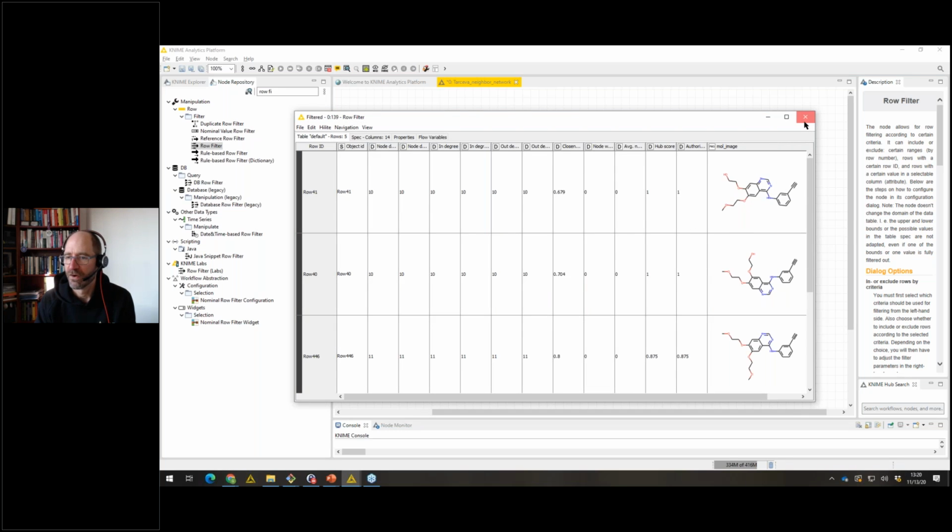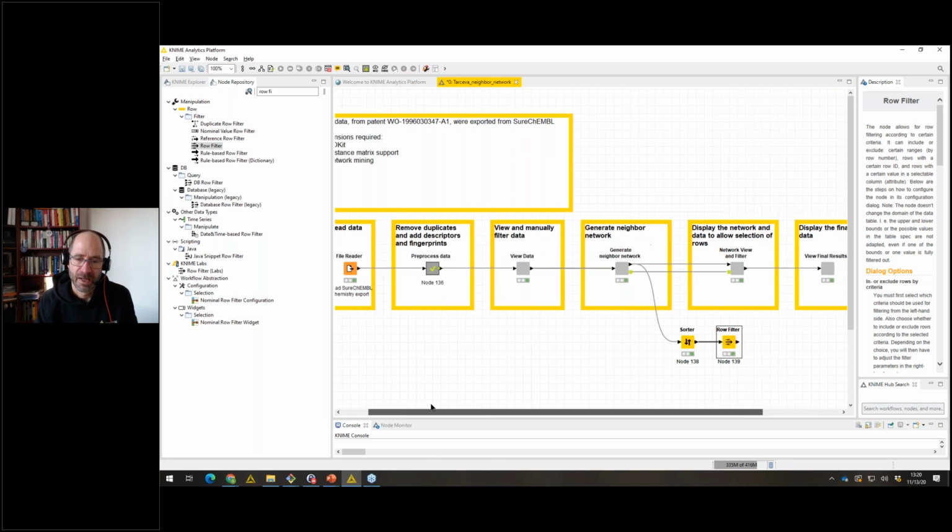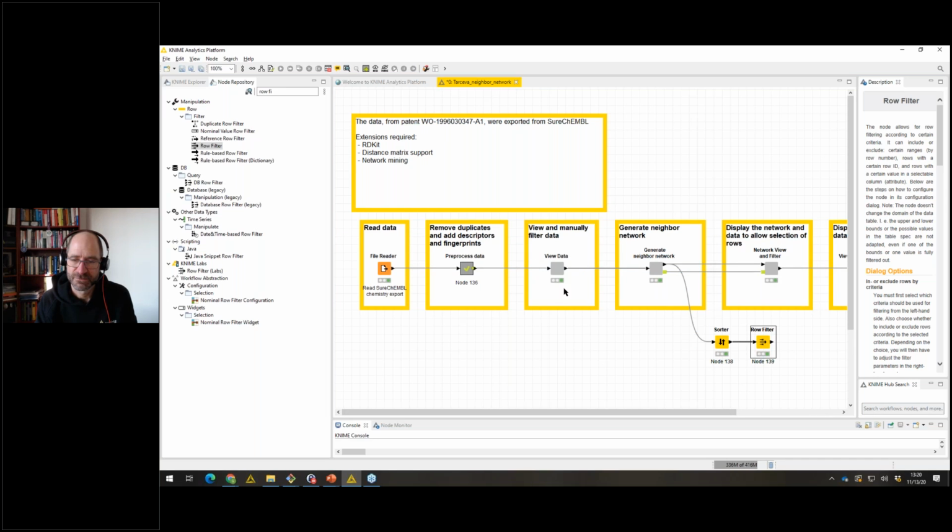So this would be a way to automate the whole process, and I could then write that out to an Excel file. If I wanted to have this workflow so that I could run it completely automated, I've manually picked the settings for this the first time, and then they're saved with it. I've manually picked a threshold that I think works, and then it's saved with it. And then I execute the workflow, change the file, and I have a manual or an automated way of doing the analysis that we just saw.